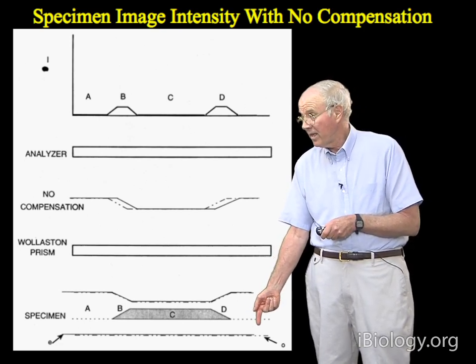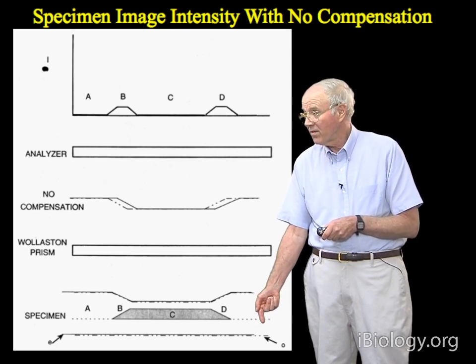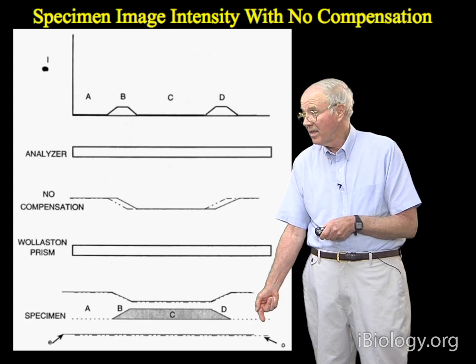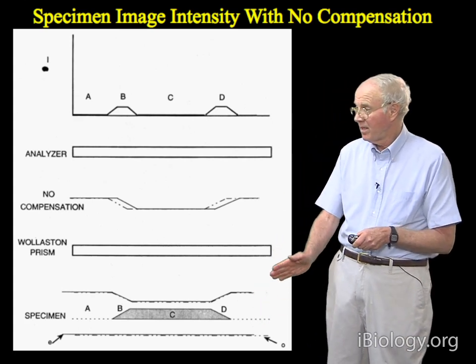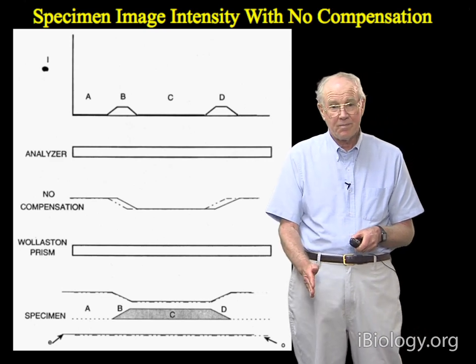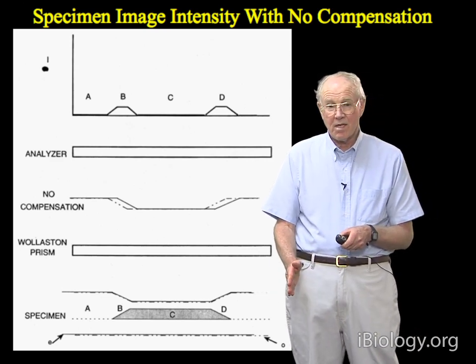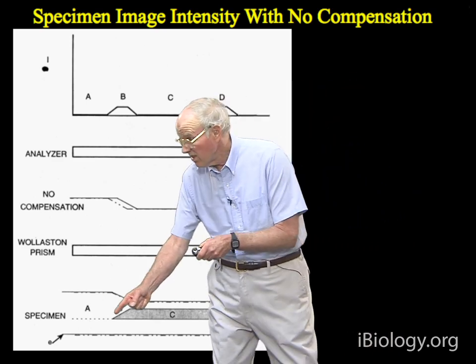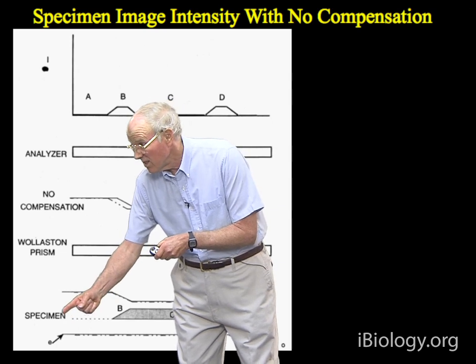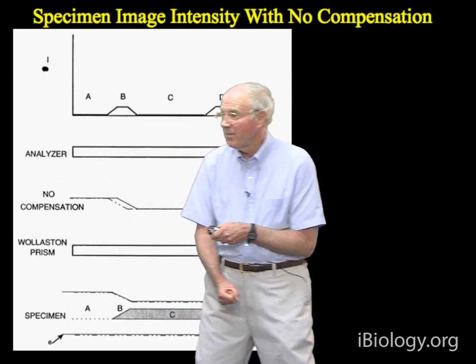For this case, the O wave is drawn as a semi-dotted line here, and it's been translated to the right-hand side, and the E wave, which is a solid line, is translated to the left-hand side, as you can see way over here. The E wave ends there, the O wave ends there, right?